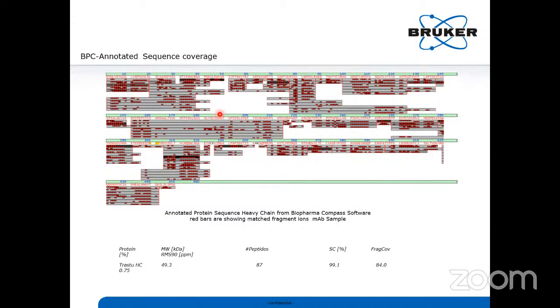Intact level we confirmed, subunit level we confirmed. Now you can observe here closely from E until R. This is, for example, a mapped sample. It's a heavy chain mass. So these small red bricks are nothing but your fragments. From 10 until 450, this many amino acids, I already did the digestion. I made this heavy chain into peptides. Those peptides went under fragmentation. By doing this fragmentation, I confirmed each and every peptide at the fragmentation level, and the sequence coverage you can observe here.